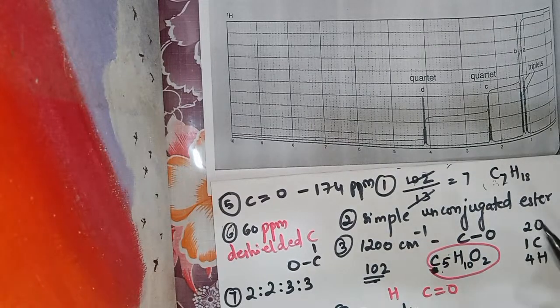I believe you all can see the graph. These numbers will add up to the 10 total hydrogens.